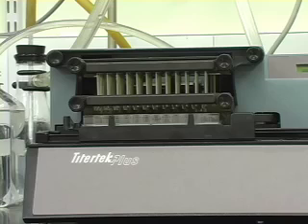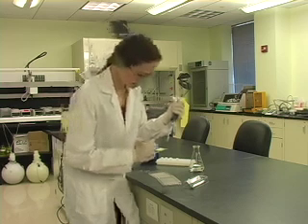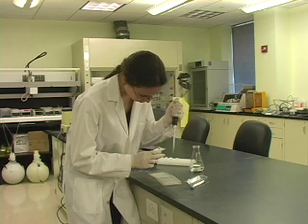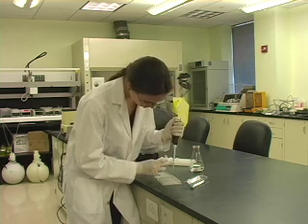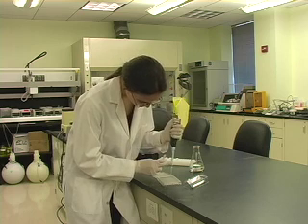Wash the plate with an ELISA washer to remove any unbound blocking agent. Add test antigen or sample with possible antigen. Run samples in triplicate. When running an ELISA, always run a set of standards, blanks, and positive and negative controls. Cover and incubate the plate.